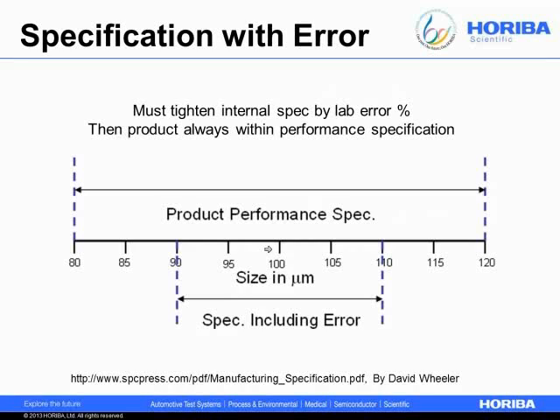And again, we're seeing a slide that talks about how we can set good size specifications. And in this case, the slide is saying that whatever you set as your external product spec or process specification, it always should be wider, and in this case, significantly wider than whatever your internal specification is. And this is one of those common sense things. You don't necessarily want to give yourself headaches if you can avoid it, so long as it doesn't adversely affect either your product performance or your ability to position the product that you want to sell in the market.